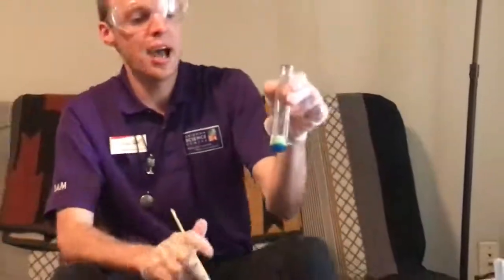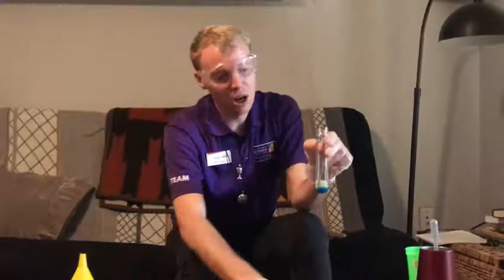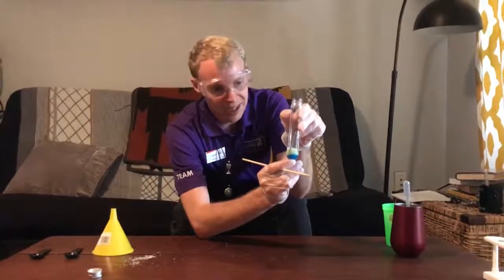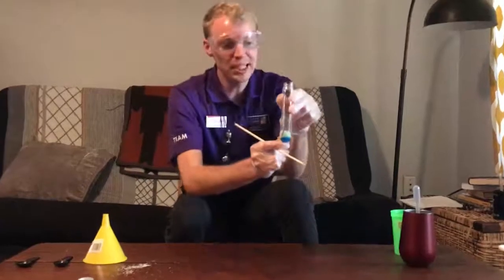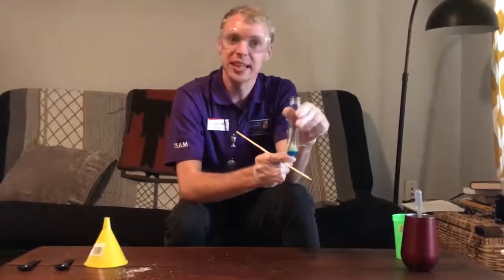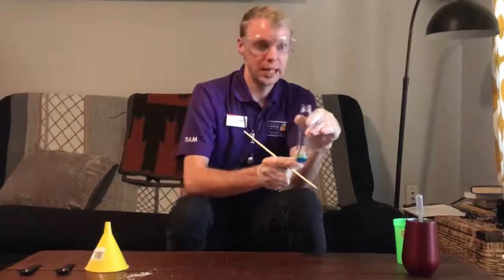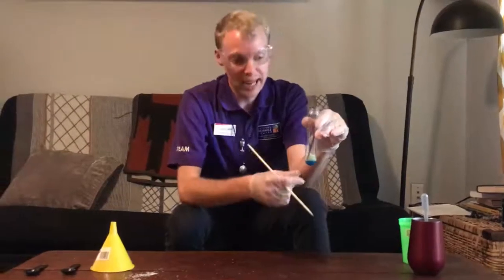So what is really happening in this is we talked about our compounds earlier. So we have copper sulfate in the bottom layer, and copper is pretty stable, it really just wants to be left alone, and that's how we're going to get the copper crystals at the end, where sulfate is super, super, super needy, also known as very electronegative.